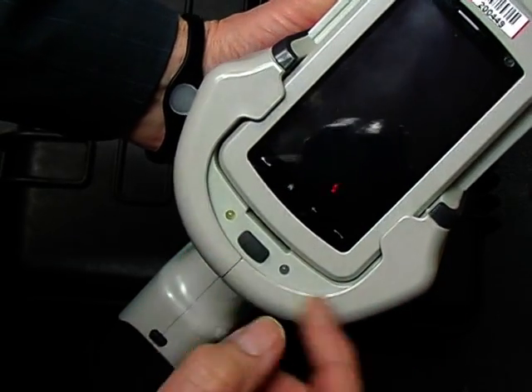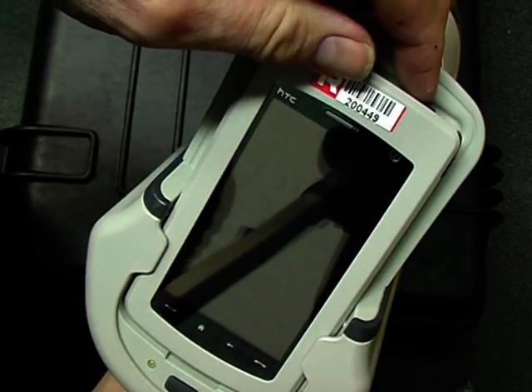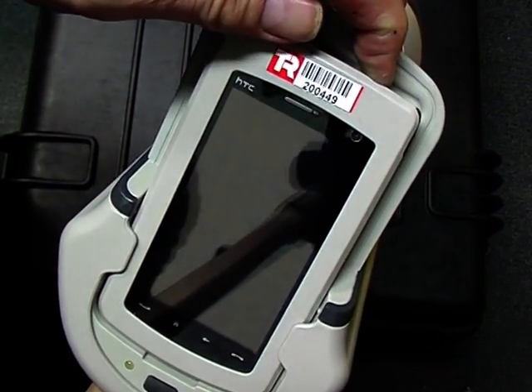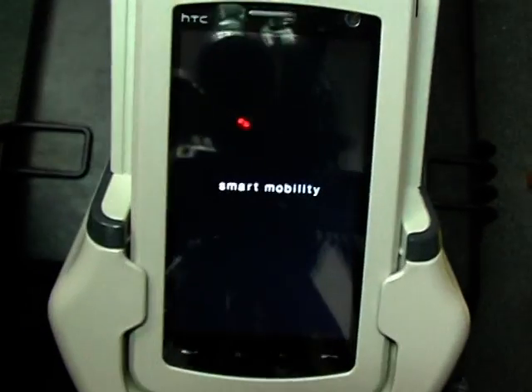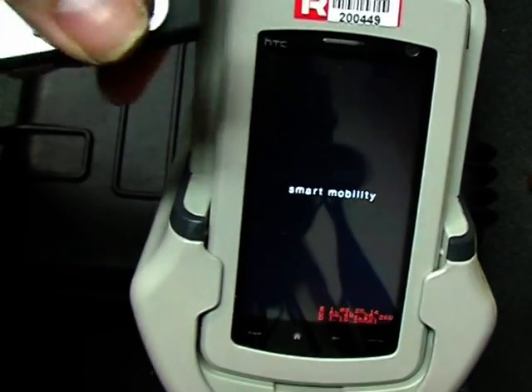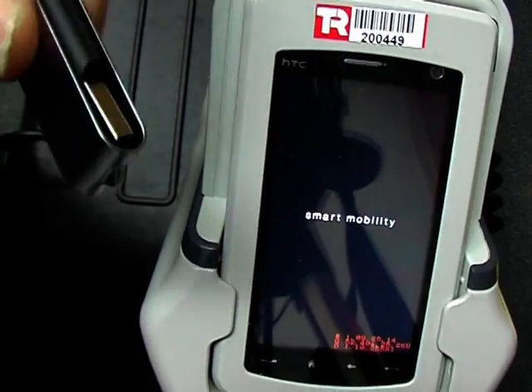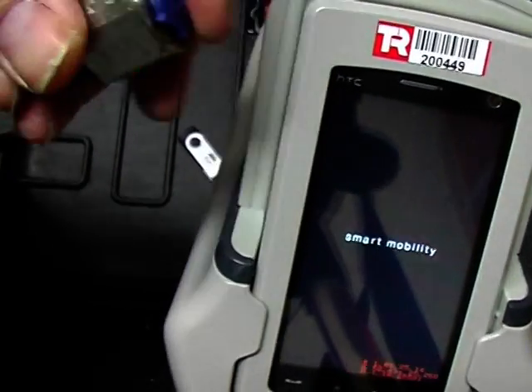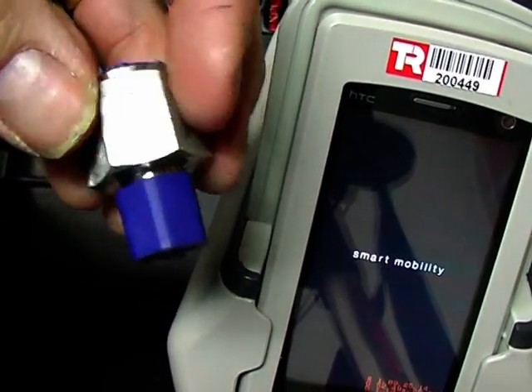Now, having inserted the battery, we need to turn the instrument on — green light — and we turn the PDA on. Push that button here, you feel it shake. Now we have two test samples: we're going to check the metal type of this cover on the memory stick, and the type of metal used in this piece here.